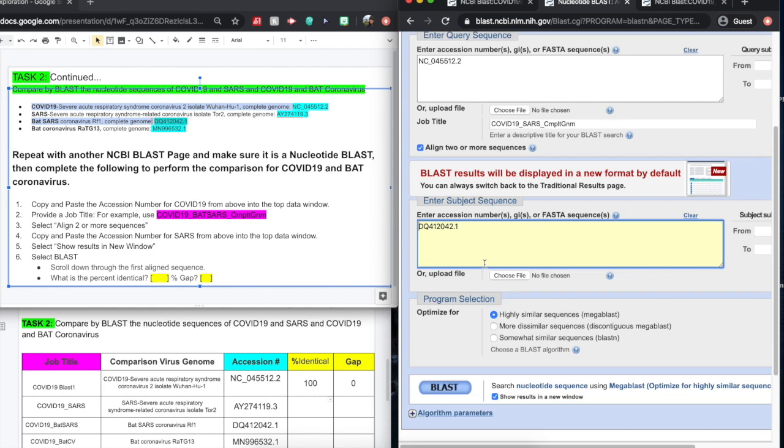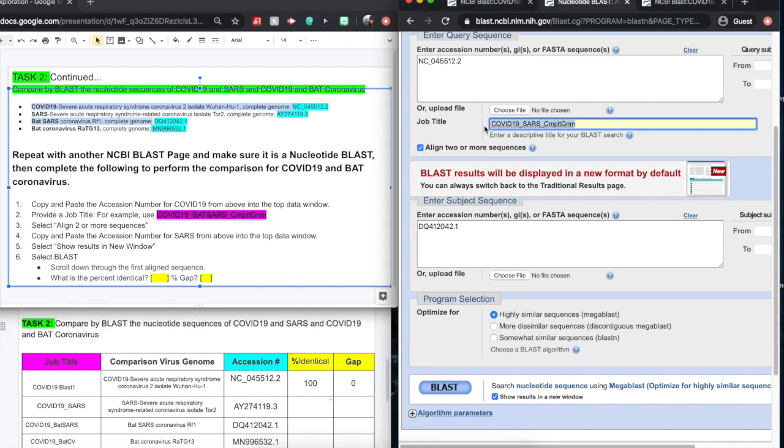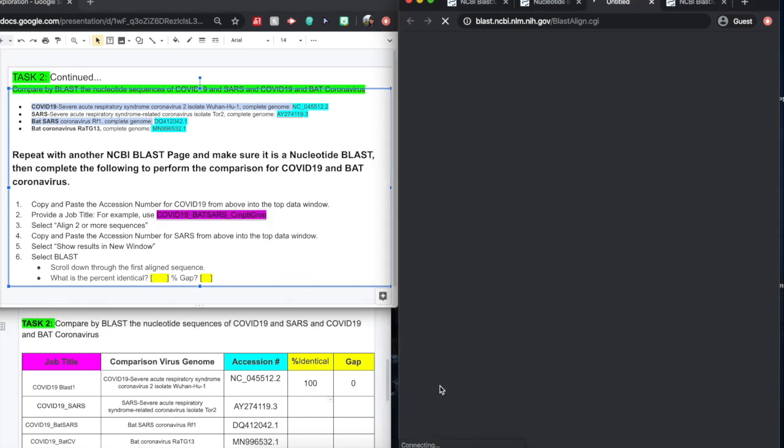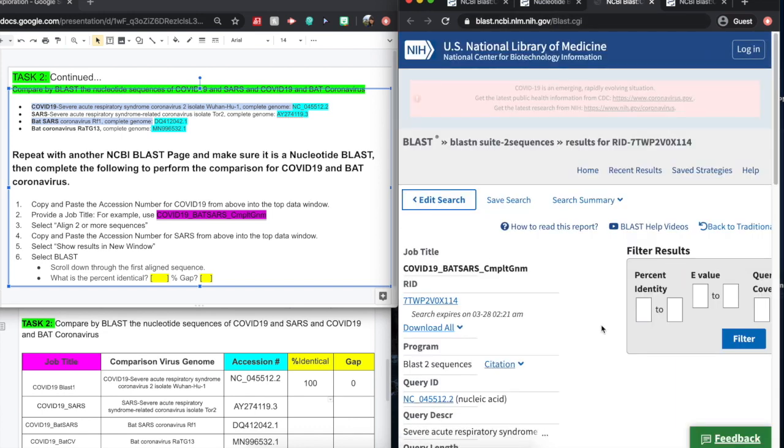Copy, paste it. Everything else should have been checked off. We just need to change our title now. And hit BLAST. A new window will pop up.